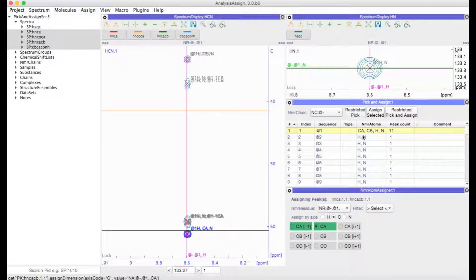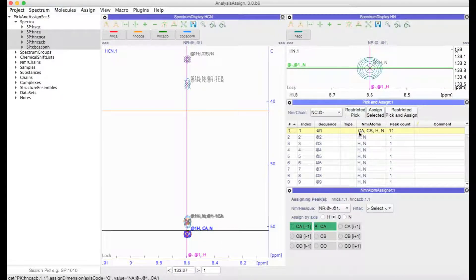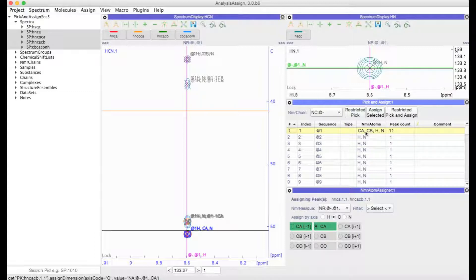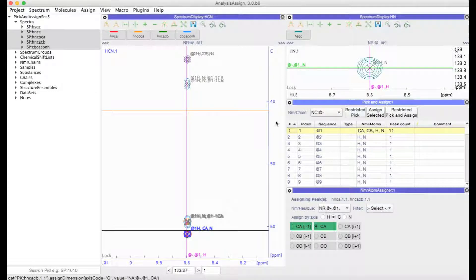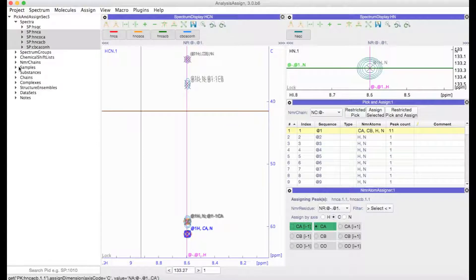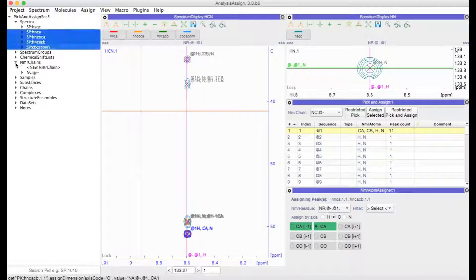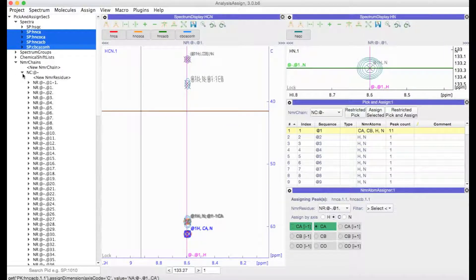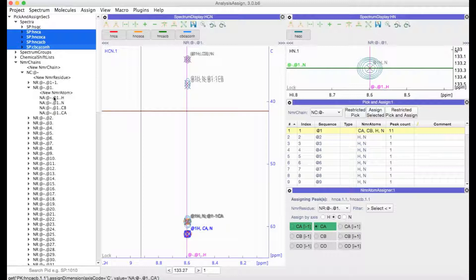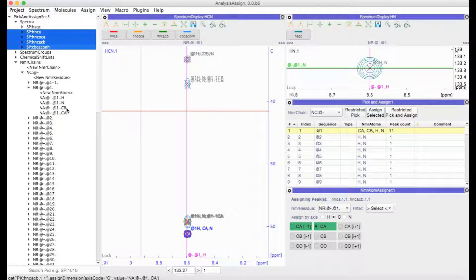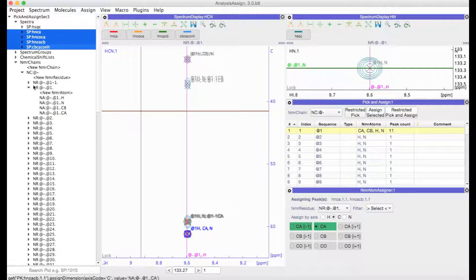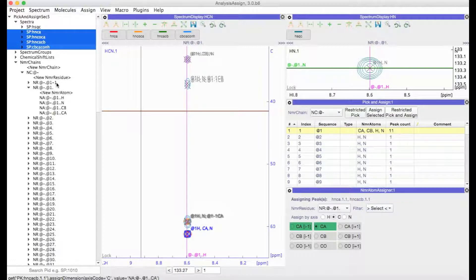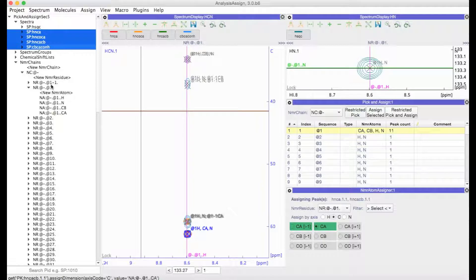And then we can do the same down here for the Cα atoms. And you can now see that the carbon NMR atoms have been added here in this table. And if you were to look on the sidebar, you can see that here too I've got my additional Cb and Ca NMR atoms.